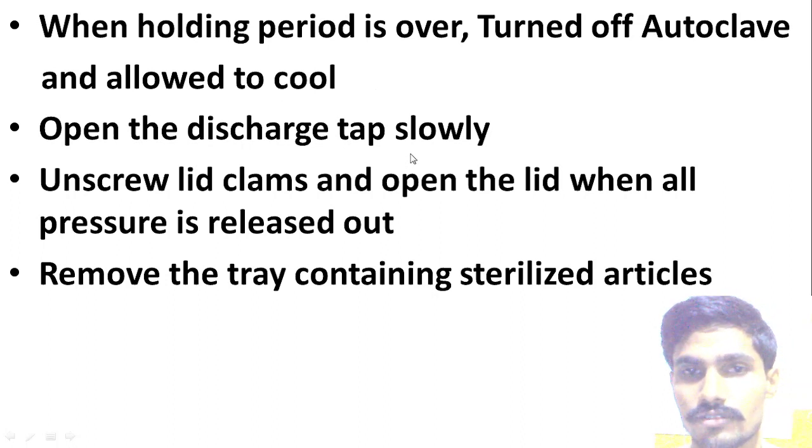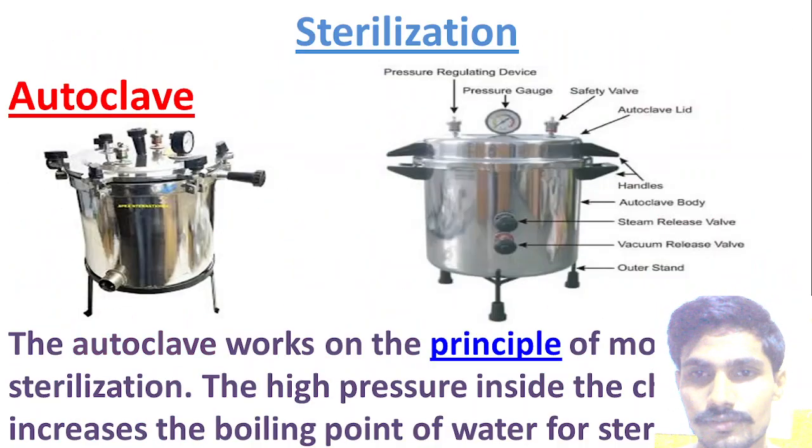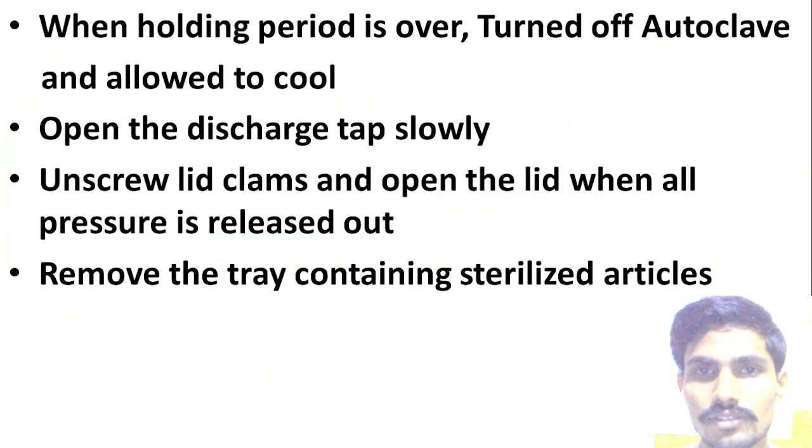Open the discharge tap slowly. There is a discharge tap that you have to open slowly, because the steam has to come out. Next, then after the pressure escapes and the steam comes out, what can you do?